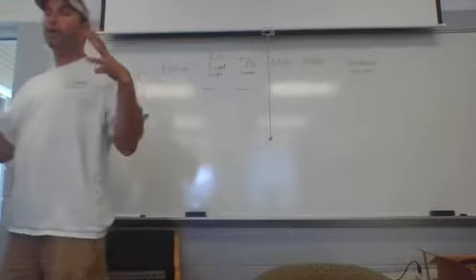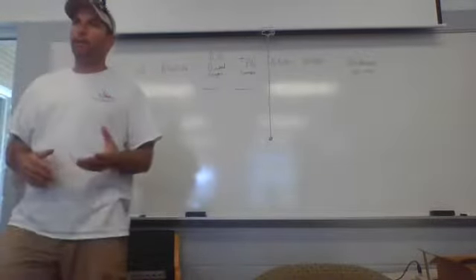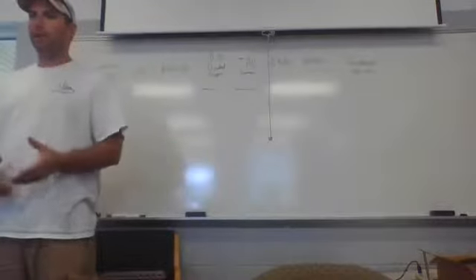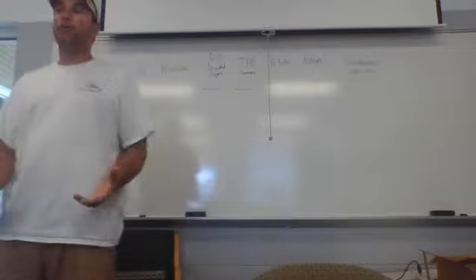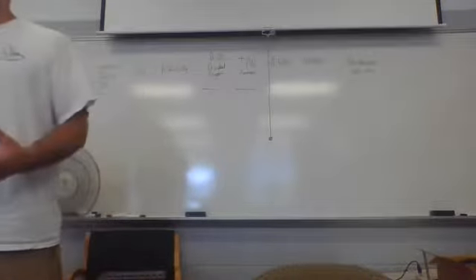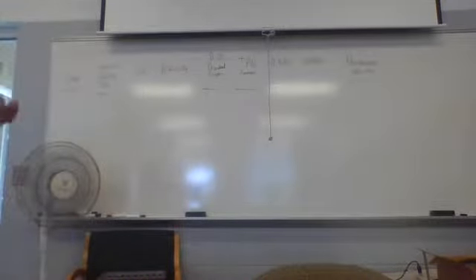All right, so we've gone over a lot of the major parameters that are typically measured in an aquaculture system. Now we're going to talk about how you measure them. There's multiple ways of measuring almost all of these different ones. We tried to list up here most of the ones that we talked about. So we're going to see what you guys know that you can use to measure it, and then we'll fill in and I'll show you some examples of those that we have here.